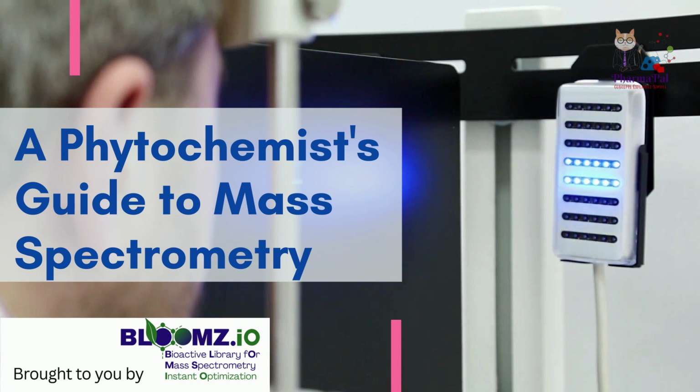Exactly. This is where understanding the instrument and the chemistry is vital. You don't just press go. Phytochemists need to tune the mass spectrometer. Tune it how? Well, for instance, choosing the right ionization technique. Electrospray, ESI, is common for many natural products, but sometimes MALDI or others might be better depending on the compounds. Okay, so the ionization method matters. Right. What else? Optimizing for high resolution. A high-resolution instrument can measure mass with much greater precision, allowing you to potentially distinguish between compounds that have very, very similar masses, like those isobars.